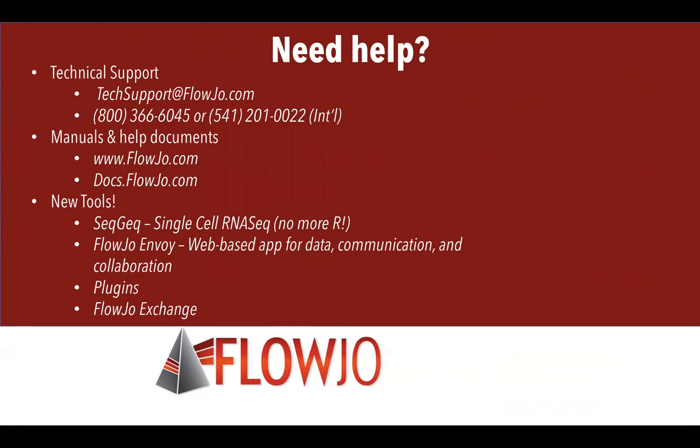There are some webinars that we've done that are very specific. So if you're looking to figure out how to do t-SNE analysis or use some of the new clustering tools that we have available, we do have webinars that cover those topics specifically on our website, on our recorded webinars page. And all of that stuff can be found just by going to flowjo.com and clicking on the Learn tab.